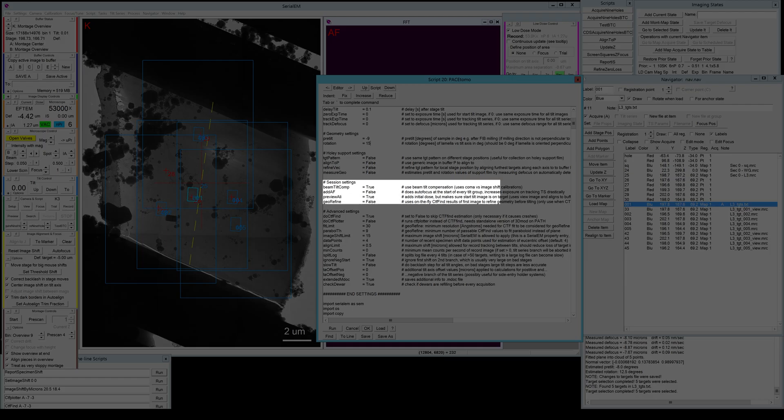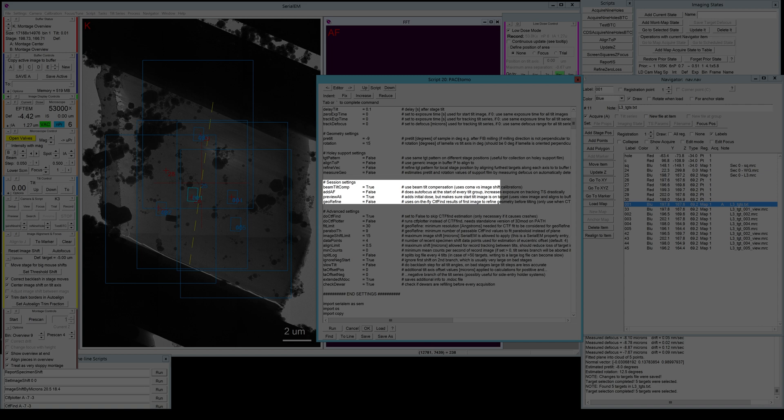Then we have a couple more settings here. This is the beam tilt compensation, and this you should of course always set to true to compensate for any beam tilt versus image shift. But this requires that you've done the calibration before, and I showed this in the very first setup video. If you're really paranoid about keeping your autofocus within bounds, you can also run an autofocus at every tilt branch on the tracking area. This will cause a lot more exposure on your tracking area and basically makes it useless. But if you want to sacrifice this to make sure your autofocus works well, you can use it here. I never use it.